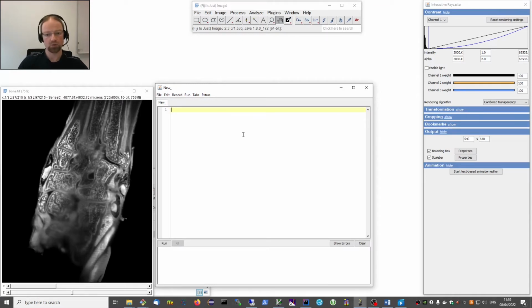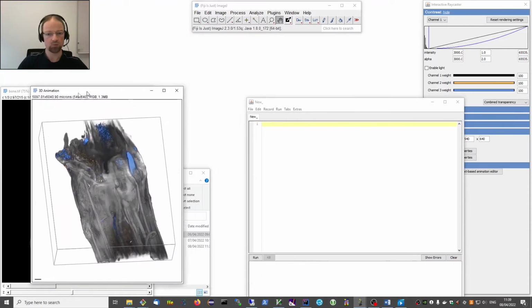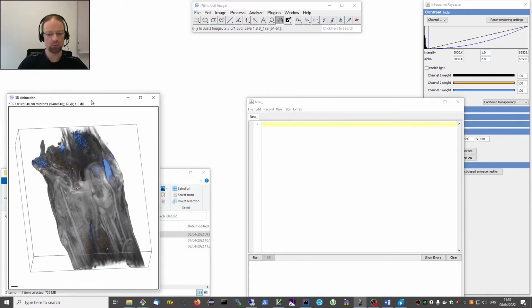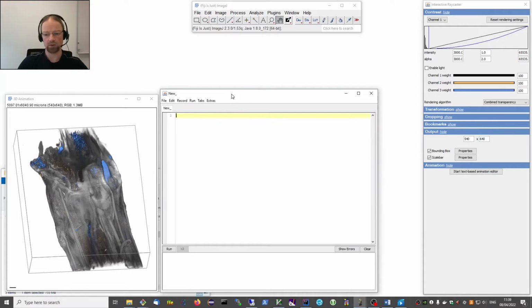There are different approaches. The most used one is probably based on keyframes. In 3Dscript, you create animations by telling the software in sentences. So what does this look like? Let's start with a simple example, and let me just hide this one and move the preview to the left and have this in the middle. This will also show you that you don't need to remember anything if you use it.